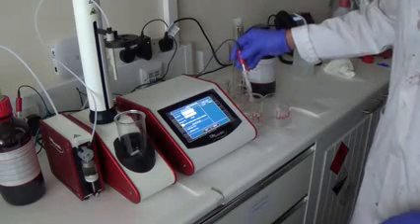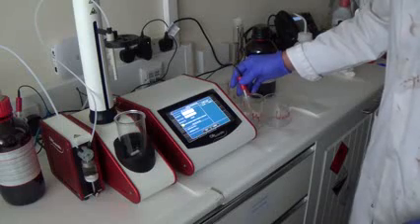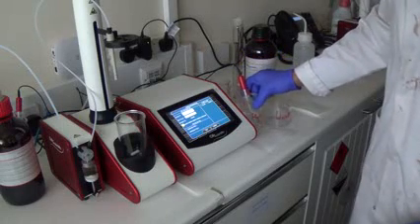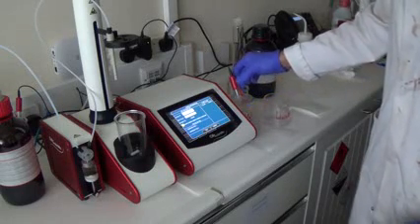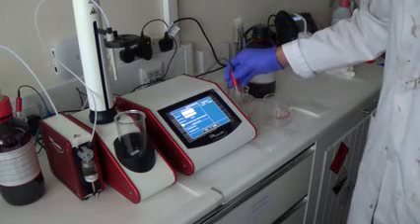Okay, so our electrode has been conditioning in water for about 5 to 10 minutes. Normally it's best to leave it 5 minutes in between each sample. We don't want to store the electrode in water for any long periods of time.